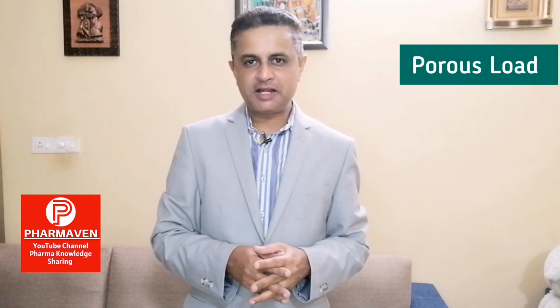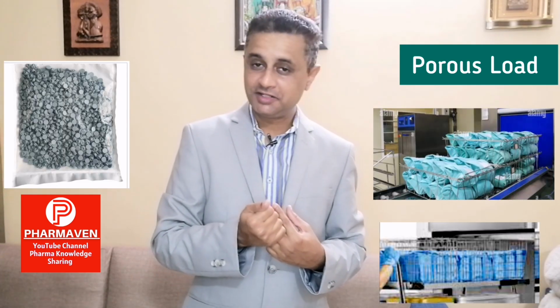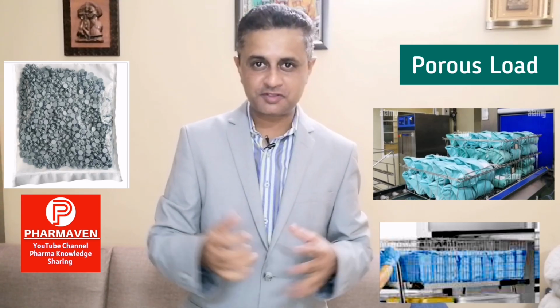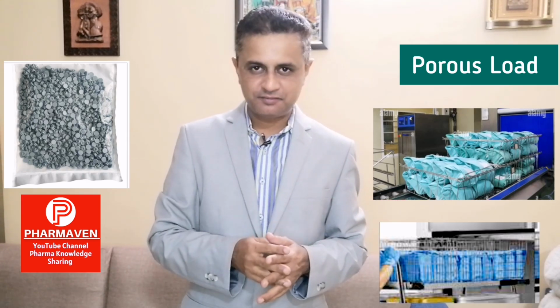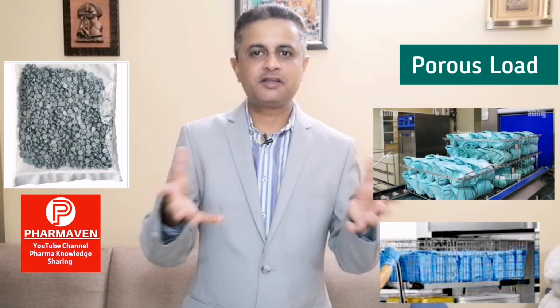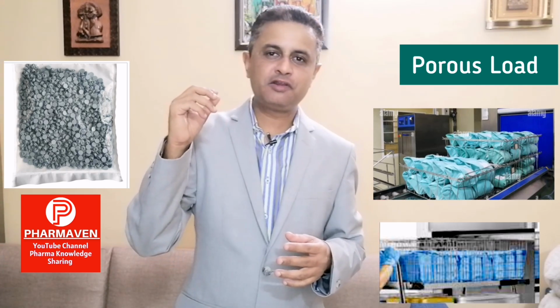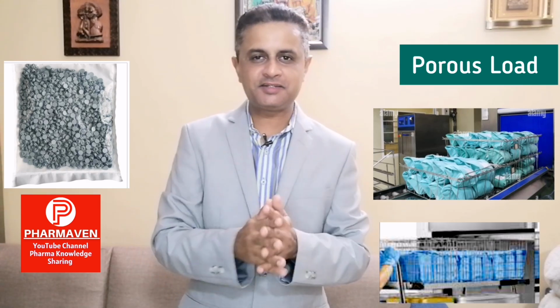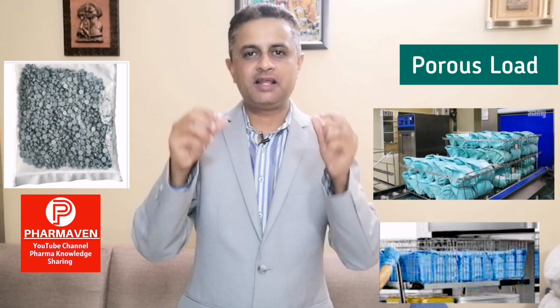In our day-to-day life in autoclave, in sterile manufacturing, we sterilize garments, we sterilize seals, we sterilize rubber stoppers. These bags are there which contain small items. Garments, the garment itself has pores. So when we talk about the terminology porous, it indicates that whatever you are sterilizing has pores inside.